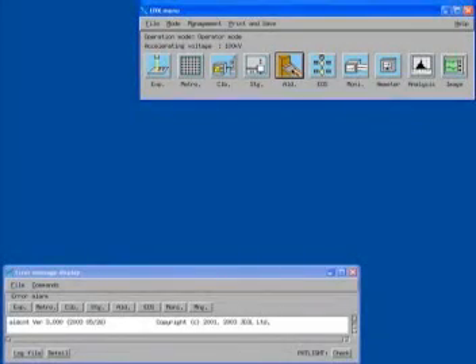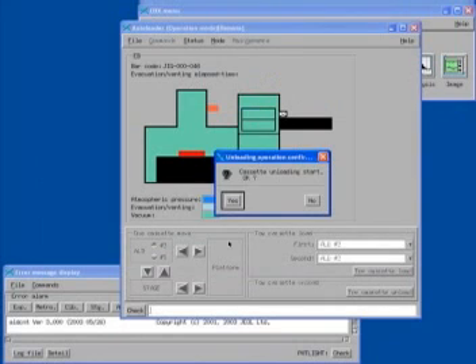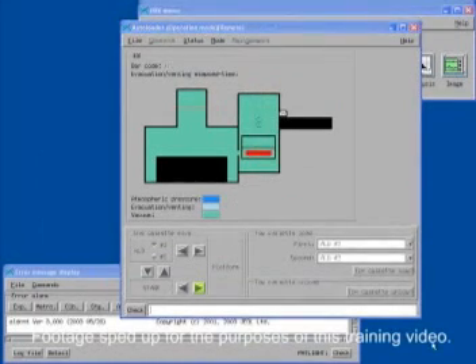When your process is complete, you can begin to unload the cassette. To do this, you must first select the ALD button from the EBX menu. The ALD GUI should then appear. Select the right arrow button at the bottom of the GUI to send the cassette from the stage to the platform. The software should detect the presence of the cassette and will ask you to verify that you want to unload it. Click the yes button. The software will automatically unload the cassette. The cassette will reload into the ALD. It will take approximately 5 minutes for the ALD to vent to atmosphere.